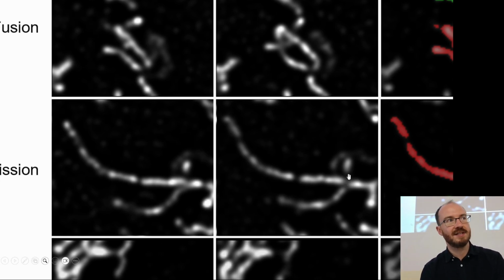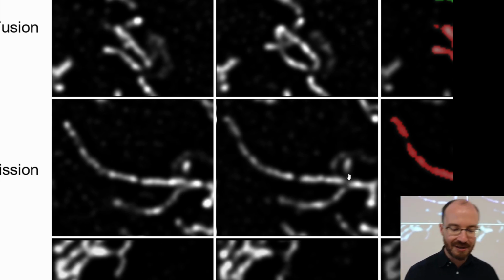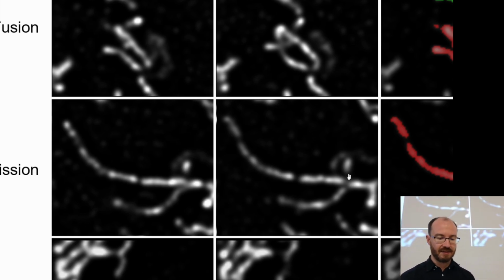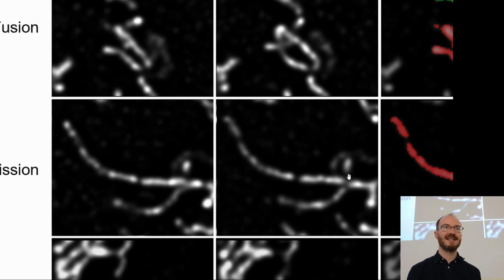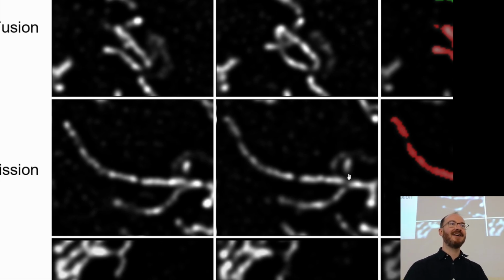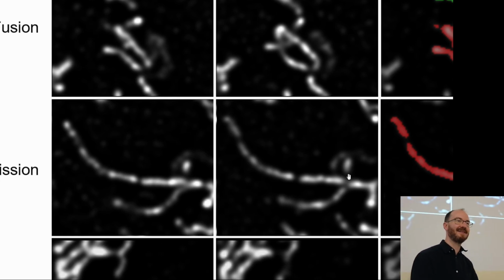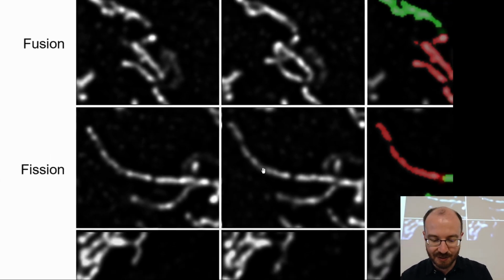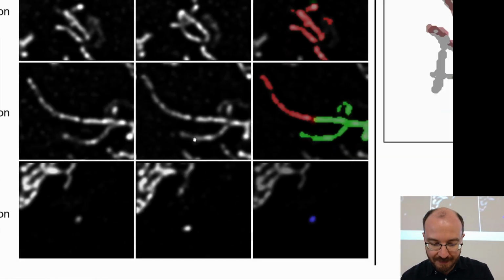So there are these challenges, and it's all down to how you pre-processed and how you segmented your images. The latest version of this tool that I've developed just takes in segmented images. The segmentation used to be brought into the pipeline, and then people were just blindly using parameters without thinking about what they're doing. So I've removed that out of the use of it. You must first segment something, make sure that this is perfect, and then you put it into this method because it's so heavily dependent on that.